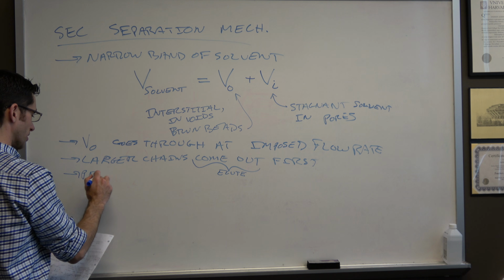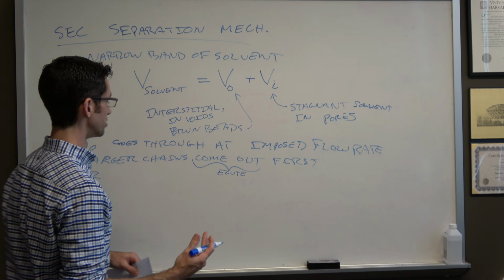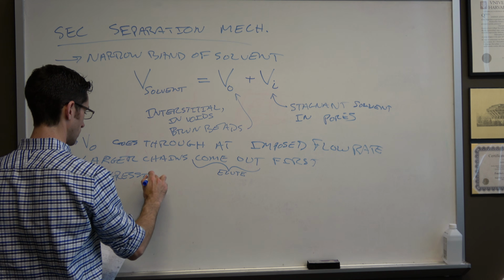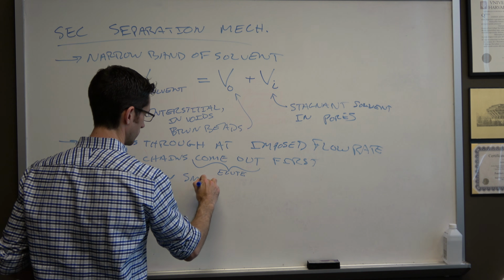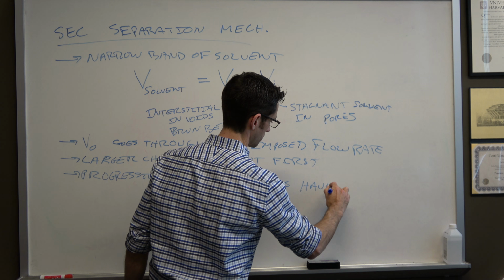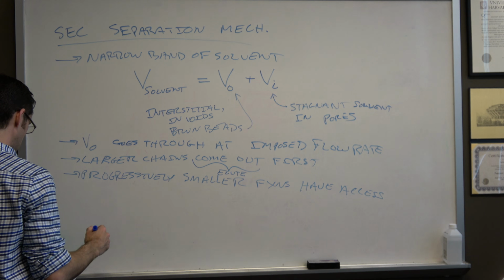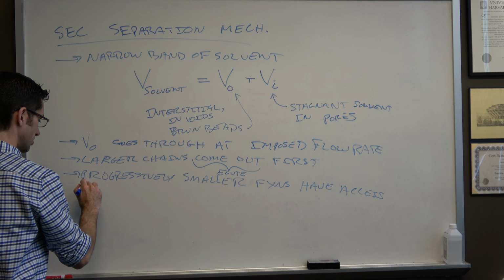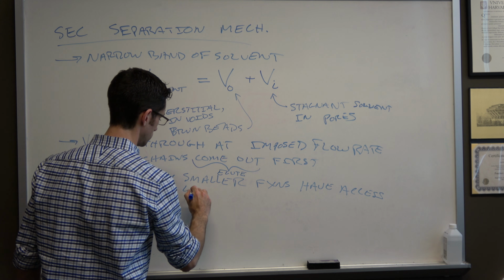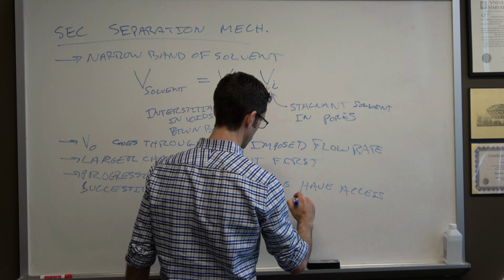And progressively smaller molecules have access to successively larger fractions of the internal volume.